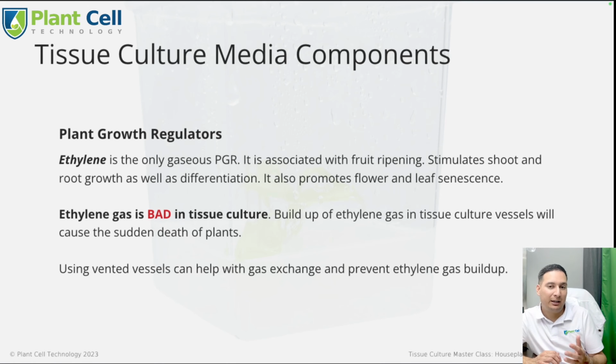If you had the issue, then you may want to have vented containers. But if the plants are growing fine and there is no problem, I just want to save the hassle of venting all the containers, or buying vented containers, which are usually a bit more expensive than the regular containers. So that's pretty much it. Ethylene gas.